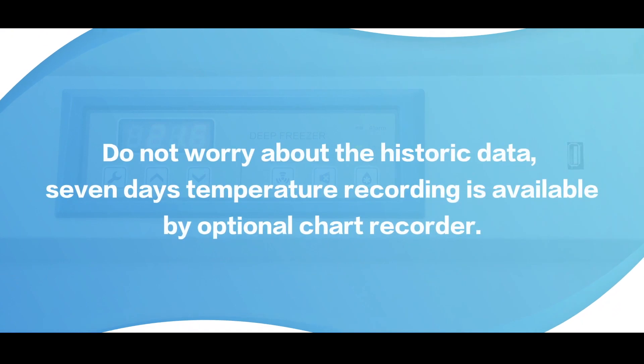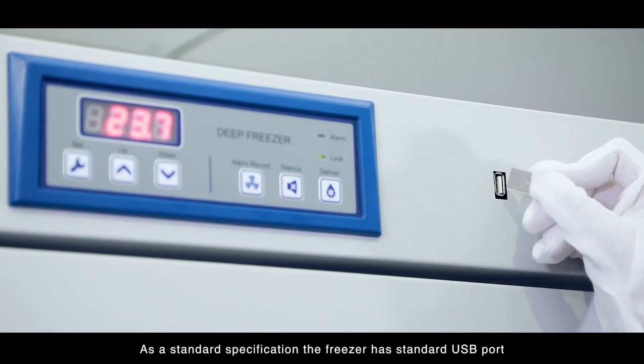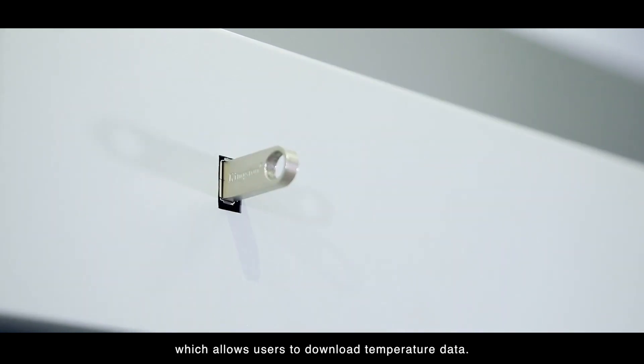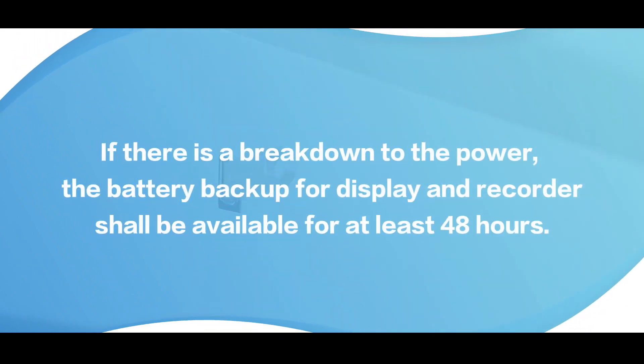Do not worry about the historic data. Seven days temperature recording is available by optional chart recorder. As a standard specification, the freezer has a standard USB port which allows users to download temperature data. If there is a breakdown to the power, the battery backup for display and recorder shall be available for at least 48 hours.